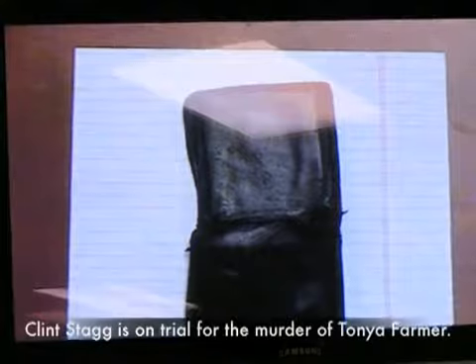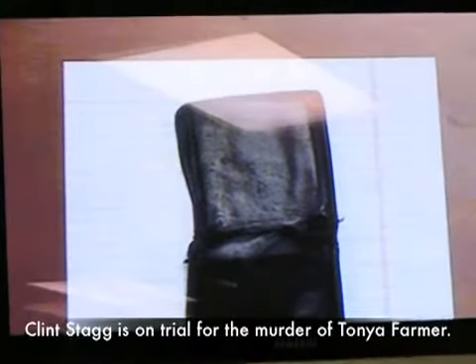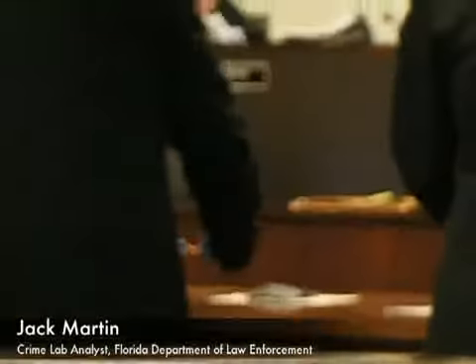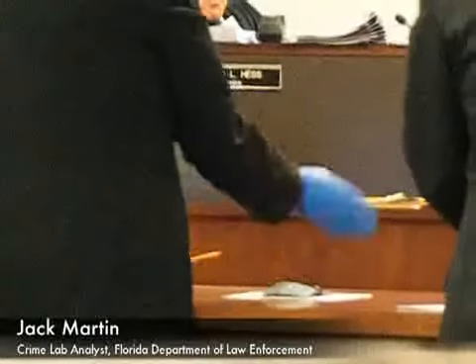of this wallet for the possible presence of blood. And there were no visible stains. And when that is the case, I perform what is known as a general rub. Take a piece of filter paper and rub surface areas of the entire wallet, do testing upon that filter paper for subject testing for chemical indications of blood.